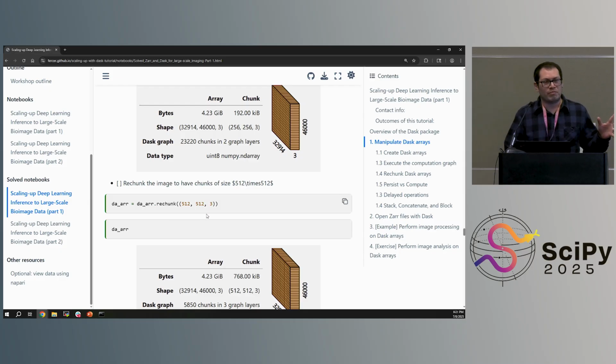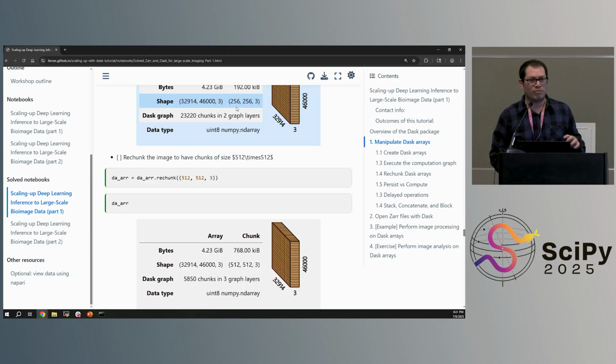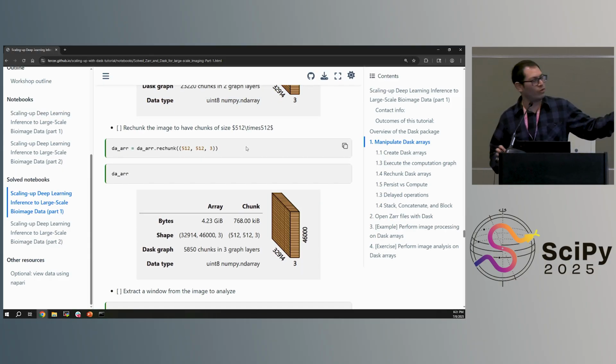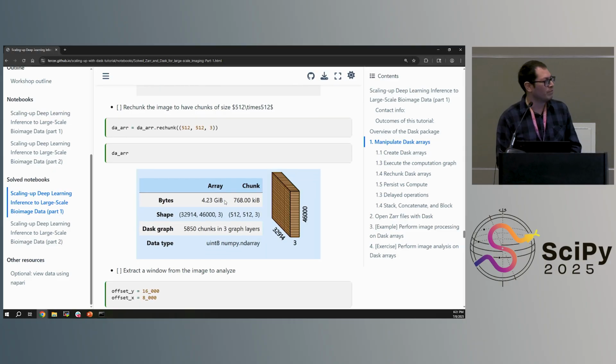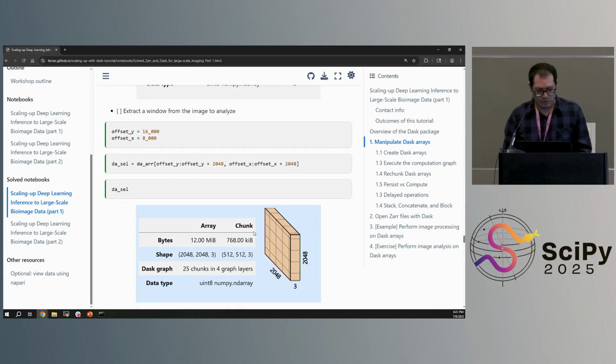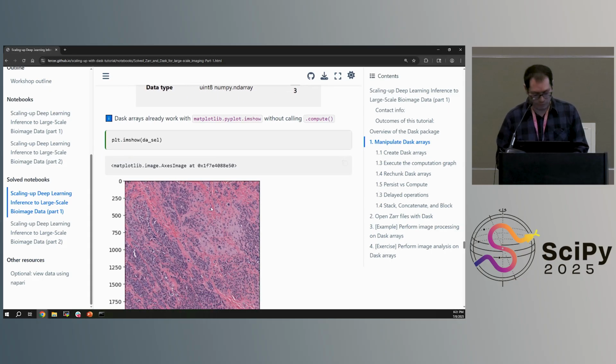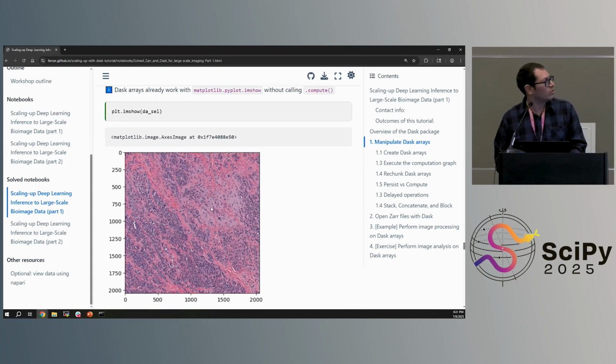So this is like probably a toy example, but of course you can think that if you are going to operate on a huge data array, you would like to prevent from doing this and loading the whole huge array on memory. So you would like to make this operation as lazy as possible. So I'm going to create this as a function. I'm going to define grid x. We pass the height, the width, and the offset. Probably the default as 0.